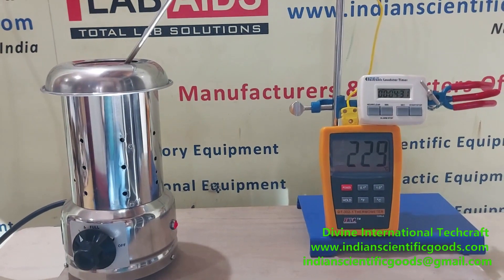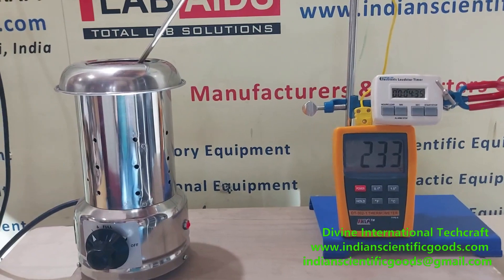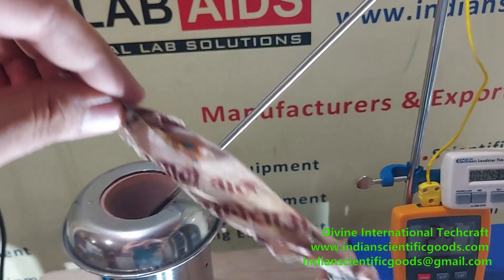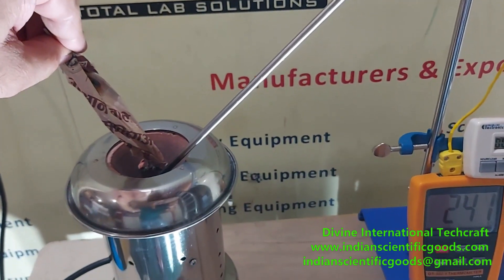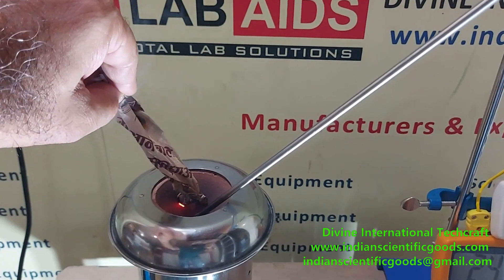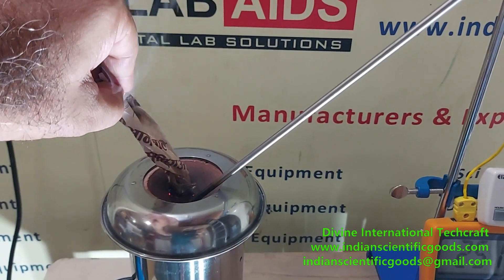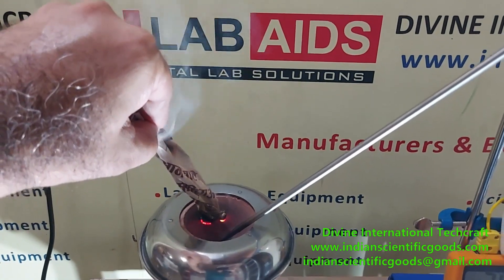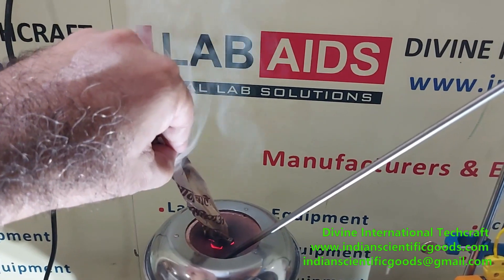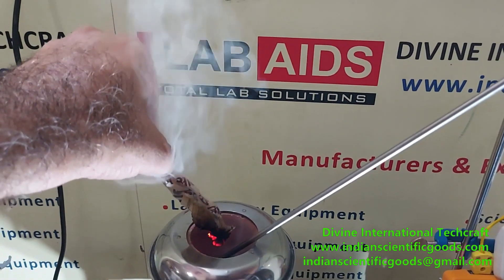We will see if we can light a fire. We can ignite a paper at this temperature using this electric Bunsen burner. I have a piece of paper in my hand. I will put it inside the burner. We can see — yes, the paper is catching fire. The paper is ignited now.